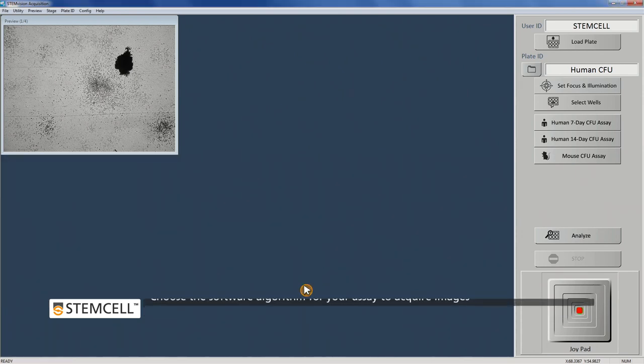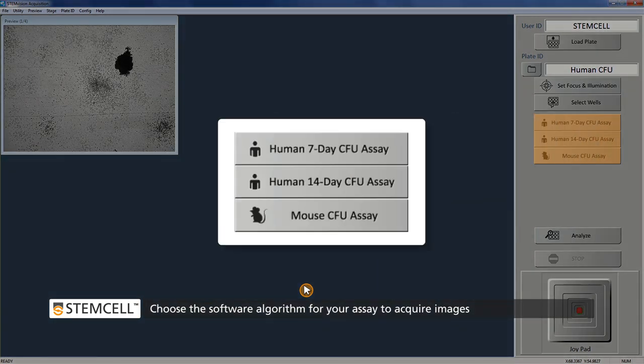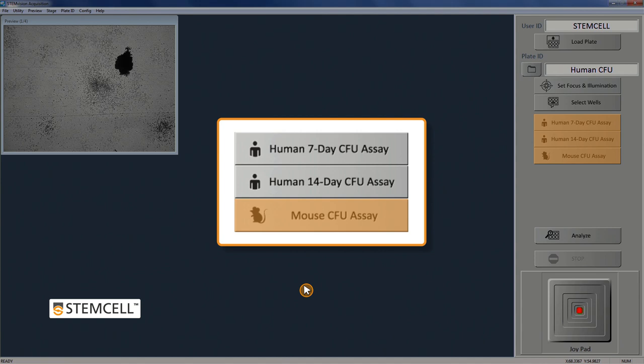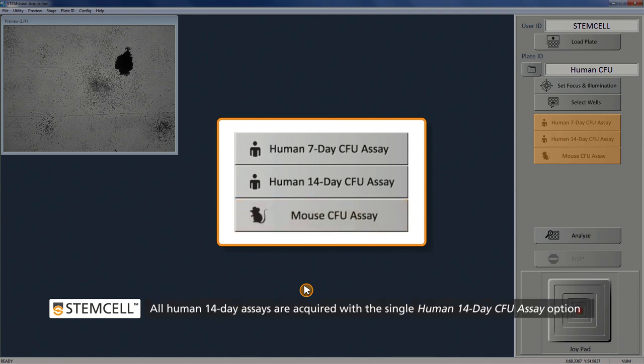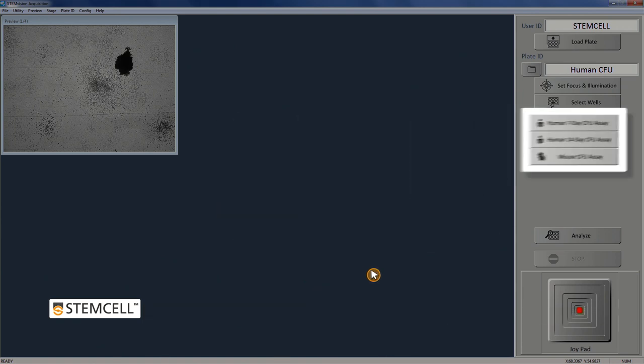Select the software algorithm from the menu that corresponds to your CFU assay type to start the analysis and acquire images. Please ensure that the correct assay type is chosen as each analysis package uses different criteria to identify, count, and classify colonies from different species and tissues.